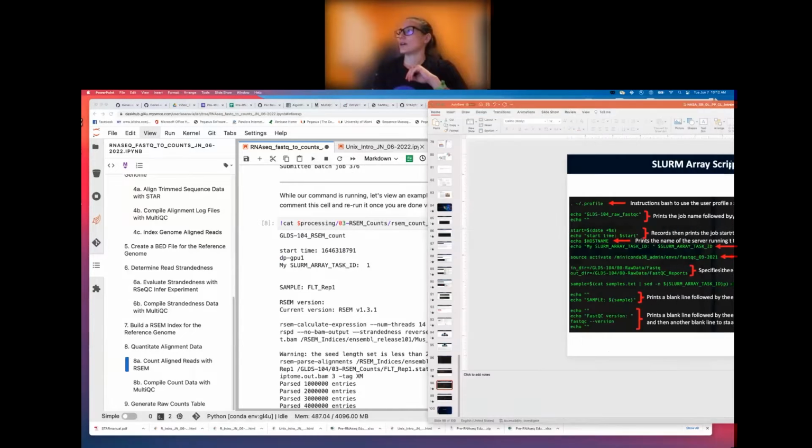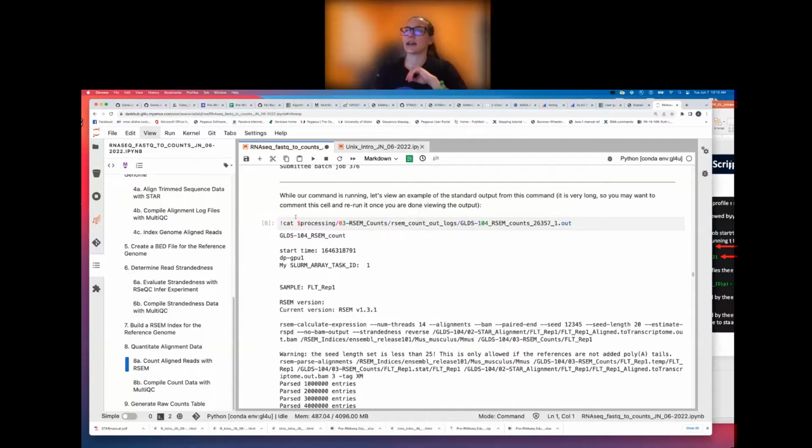Again, a lot of this stuff up front, I should ask, is there anyone who's not seeing the same output that I'm seeing here? Okay.